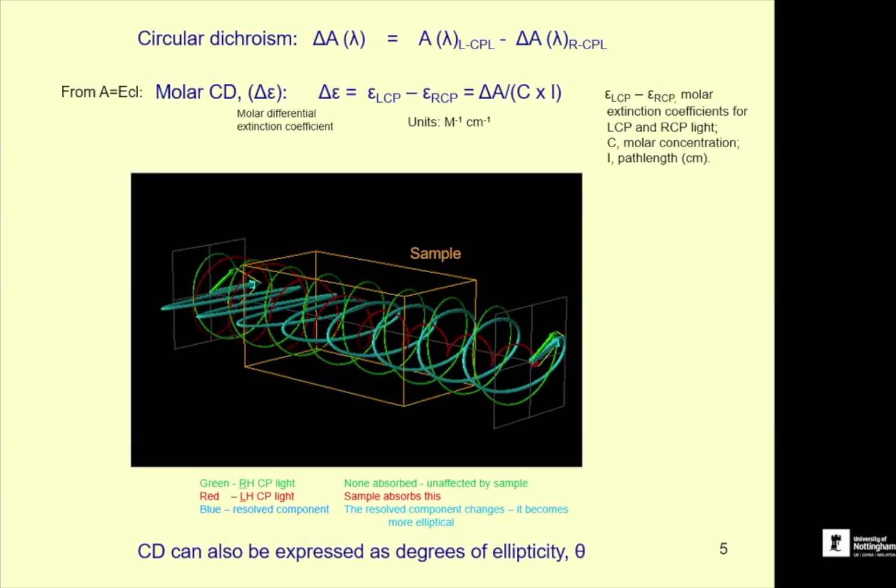And the result of that 90-degree difference in the two waves is to form a circle because it's satisfying two different directions of the light, if you see what I mean. I used to have a lovely video to show how you generate that. That's the explanation. Two waves, 90-degree difference. When you look at what the resolved component of that is, it's a circle. Okay.